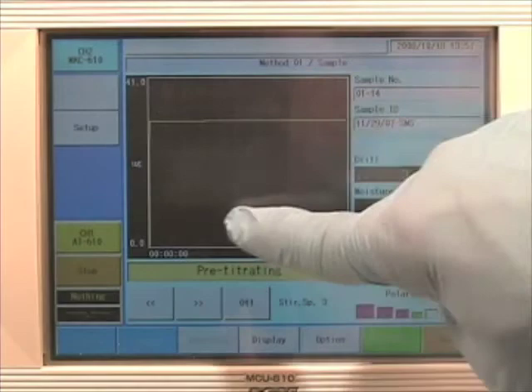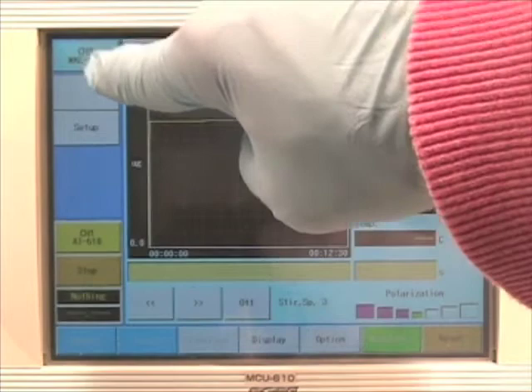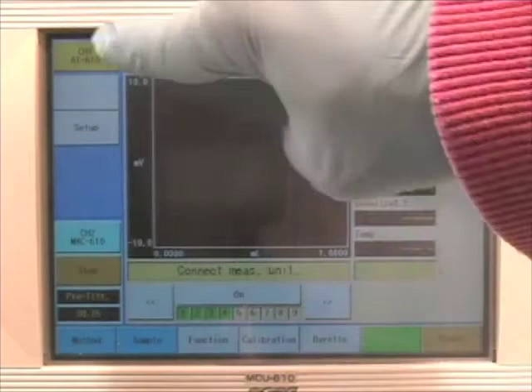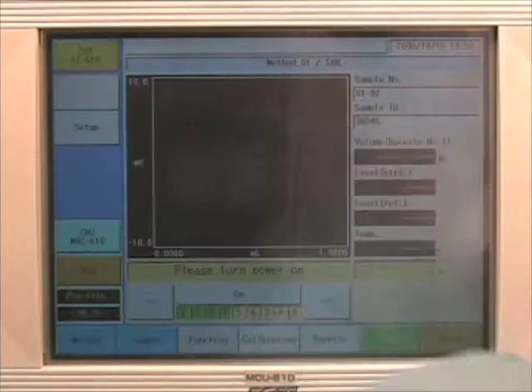So from this master control unit you can see you've got a nice big area for a graph and you have titrators. You toggle here. This is where we have the connection. So you connect and we're on the Karl Fischer and if you press the other channel you switch.